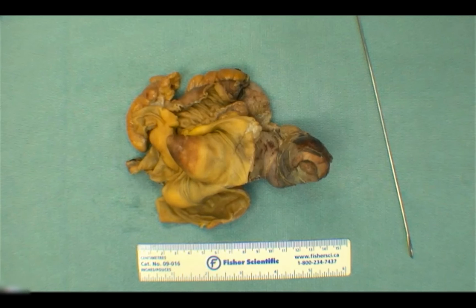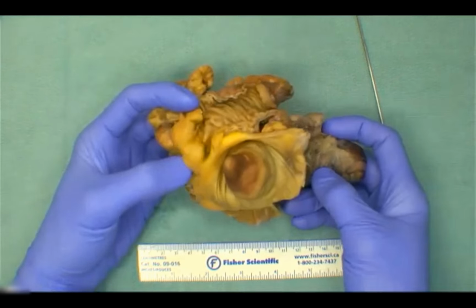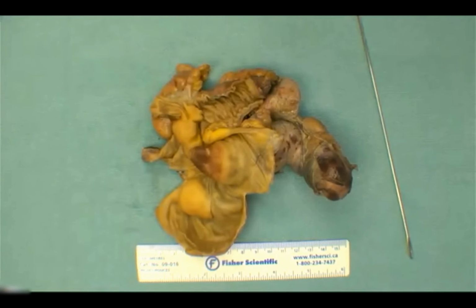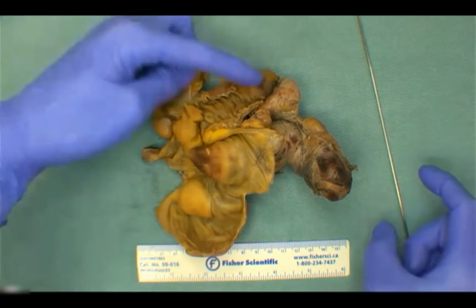That's a resection of the base of the cecum with the appendix, but generally speaking, the ileocecal valve is spared. And so because we've got our ileocecal valve here, we don't count this as a cecectomy or partial cecectomy. This might also be called an ileocecal resection. And resections for an ileocecectomy would include a piece of the ileum.